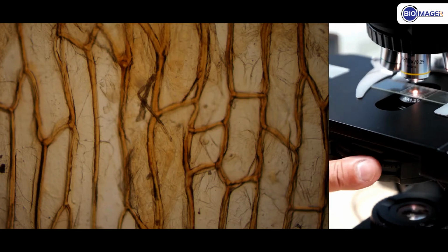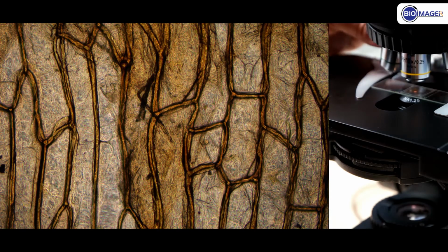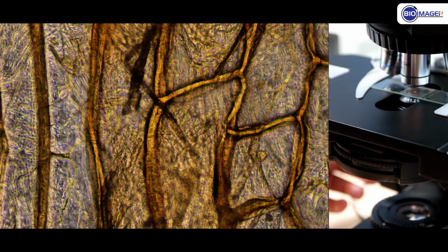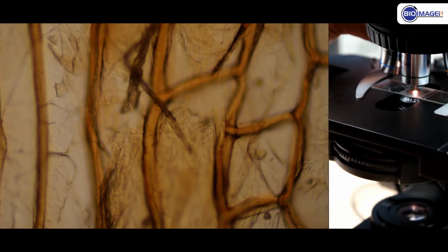So I'm going to switch to a phase contrast from the condenser, and next we switch objective lens to 20x. Now I'd like to come back for comparison to see. First we see the image in phase contrast, and I come back to bright field. You can see the image differences using this condenser. Next we switch to 40x.